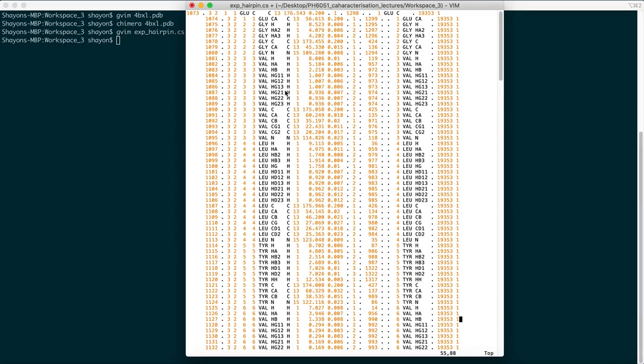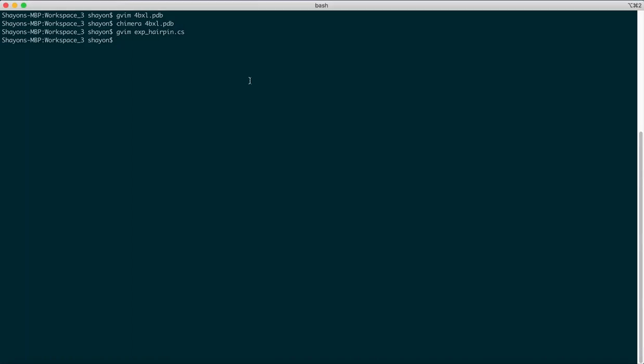So we'll do the same for the predicted chemical shift values in the files that have been written already before. So just going to save this one first, and let's have a look at the predicted chemical shift file for the static structure first, which is this one.